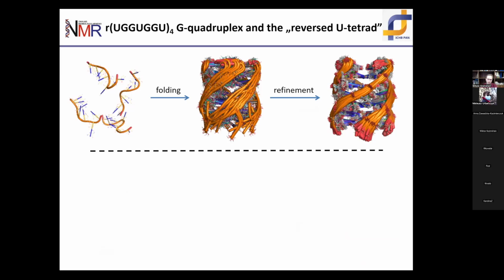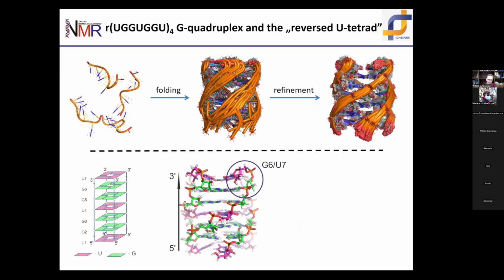Throughout all the molecule, the backbone appears to follow a more or less helical path until the 3' end, where it suddenly shifts. This is between the residue 6 and 7, where you can see this strange hook that we did not expect. If you look at it at an atomistic view, you can see that you have the tetrad from G6 and tetrad from U7, and there is a very, very sharp turn between them.